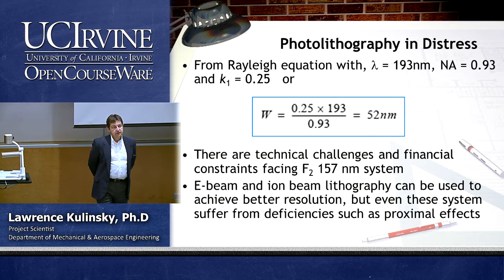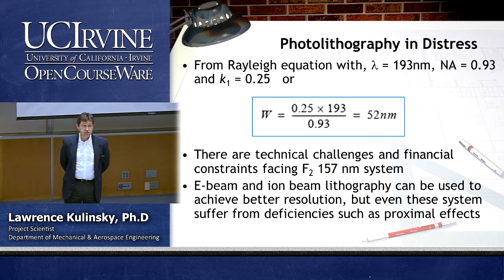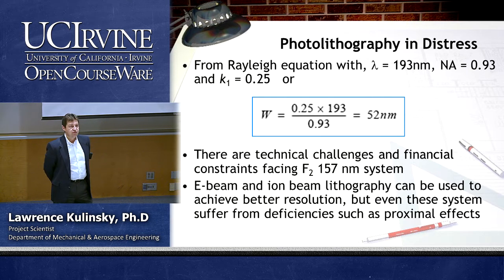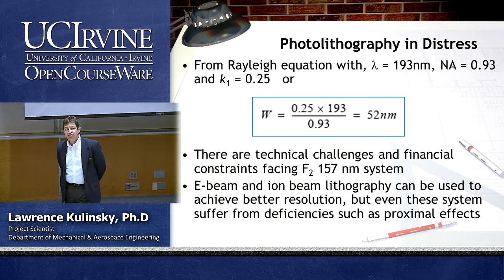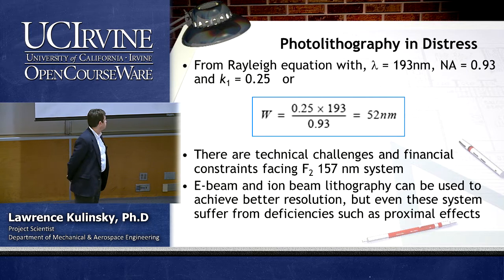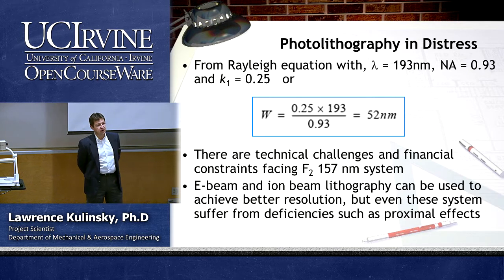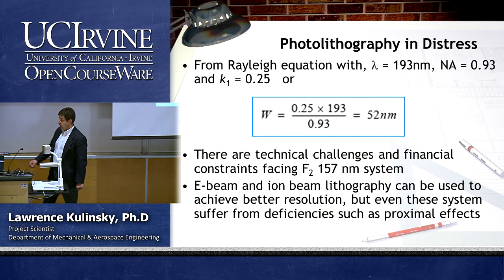As you know, the diffraction limit forbids resolving features that are smaller than the wavelength of the incident radiation that you use. For example, for conventional optical microscopy, we're talking about 200 nanometers. Even with the most advanced argon light sources, we're talking about, at best, 50 nanometers. But the proximal probe techniques that we are going to discuss today allow us to go to atomic resolution and actually resolve individual atoms.